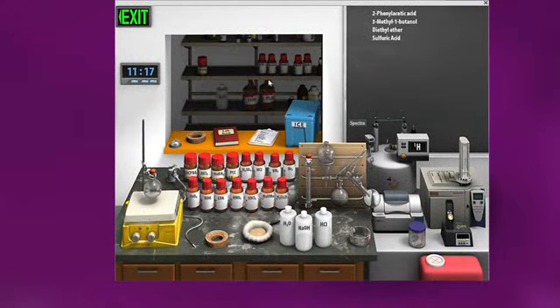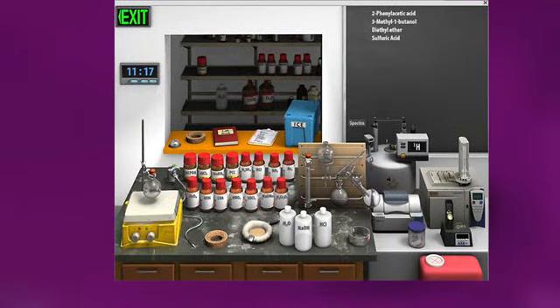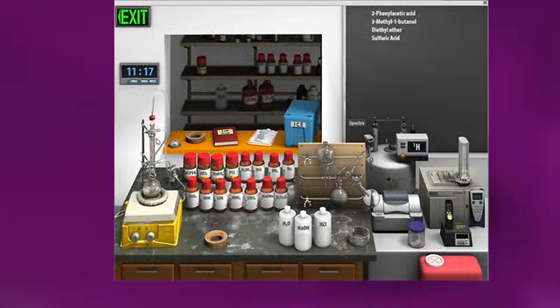So hopefully with these reagents and the solvent, we'll be able to create that ester that your teacher asked you to create. This is a pretty slow reaction, so we're going to add some heat. And if we do that, we need a condenser coil. And if we don't add nitrogen, this is going to explode, which you should try. It's pretty neat. Okay, so we'll turn this on.